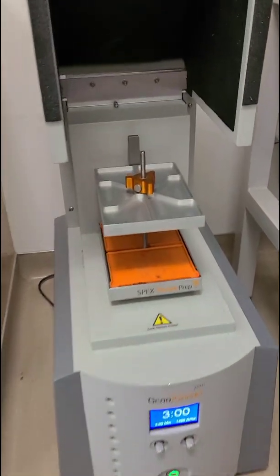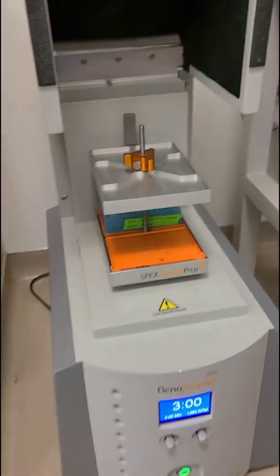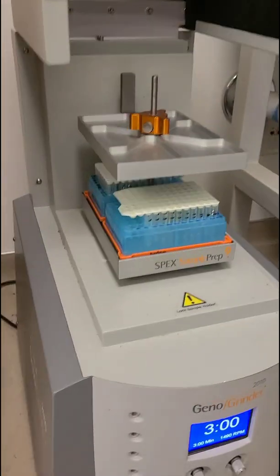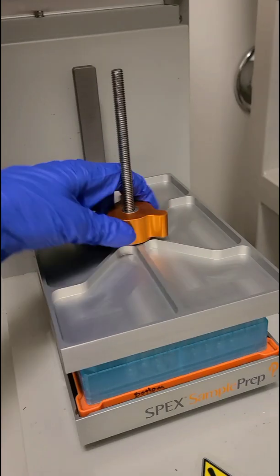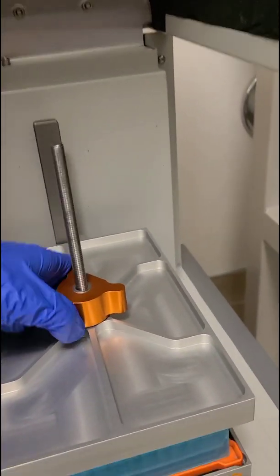This here is our Geno grinder and it is a much newer model than the one I showed in one of my very first videos, but the premise is still the same. The two plates that I put in need to be balanced, and this comes down and you tighten it really well because you don't want it going anywhere.